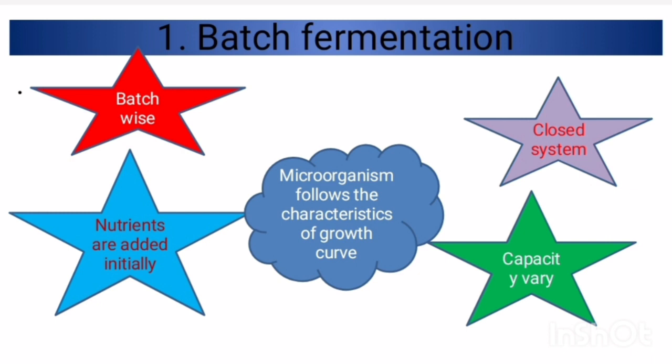A headspace is located at the top of the fermenter. This space is to allow aeration, splashing, and foaming of aqueous medium. Nutrient medium is inoculated with microorganism.